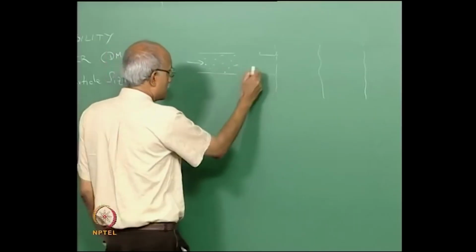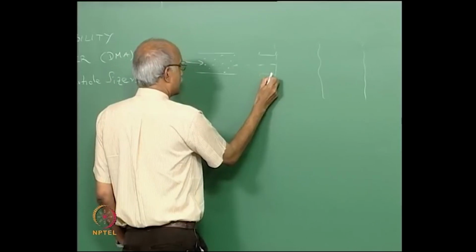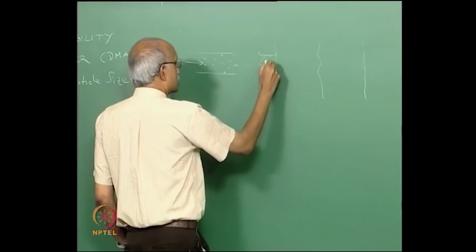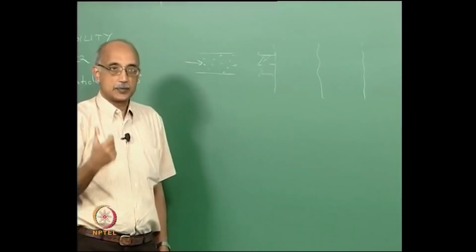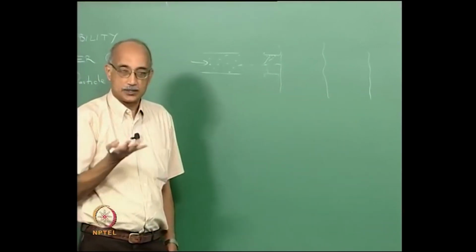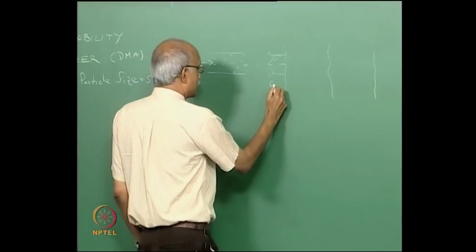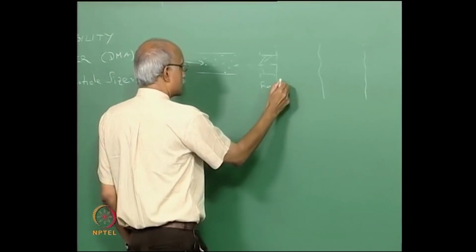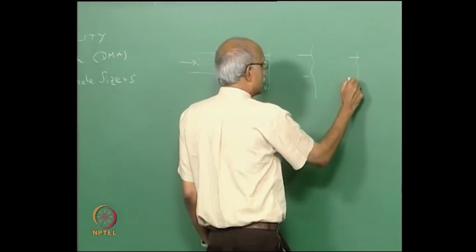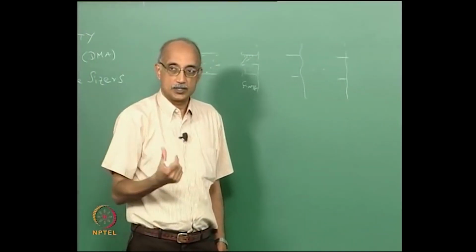And so, as the particles are flowing through, the finest particles, because they have the largest diffusion velocities, will deviate first from the flow path and get captured on these screens. So, these are typically just stainless steel wire meshes that are set up at different sizes. So, the finest particles will get captured in the first set of screens, and similarly you will have an arrangement that stretches all the way out to the coarsest particles in the stream.